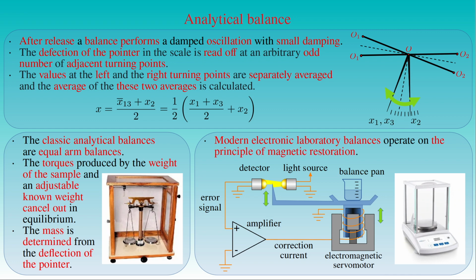Then the average electric current in the servomotor coil is proportional to the electromagnetic force that is holding the sample with a given weight at the reference position. When the load applied by the sample changes, the motion of the coil is detected by the optical sensor providing the error signal, and the amplifier automatically adjusts the current to maintain the position of the coil at a reference position. The direction and magnitude of this current change are such as to restore the equilibrium condition.